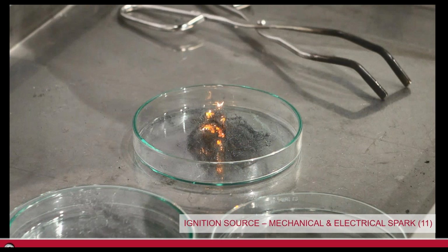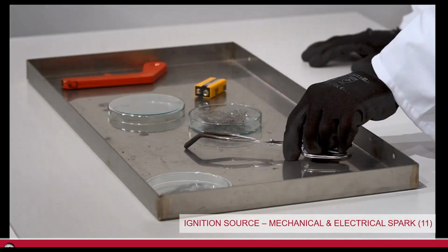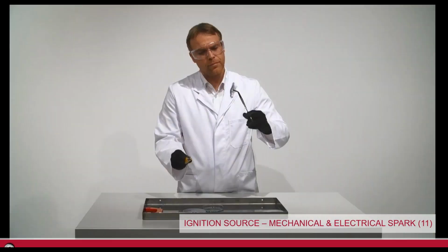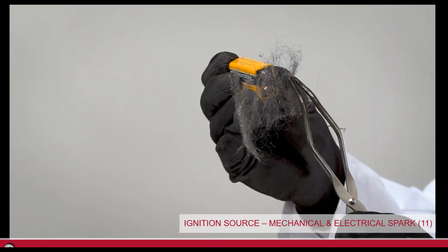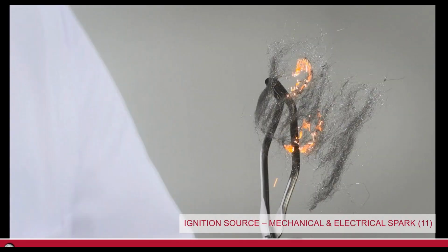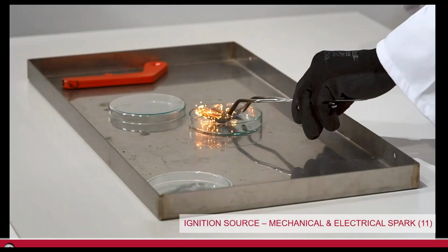Obviously, electricity. Then, if just a simple mechanical spark, electrical spark could be hotter, could be quicker. This is just a simple little 9-volt battery, so no AC, just DC. That's a fun little experiment when you put it on your tongue and you feel the charge. Well, same idea happening there, and of course that steel wool burns. So kind of fun. Got to pay attention to those types of dangers as well. One gets hot, and this one gets hot very, very fast.